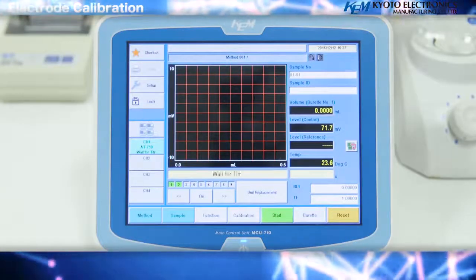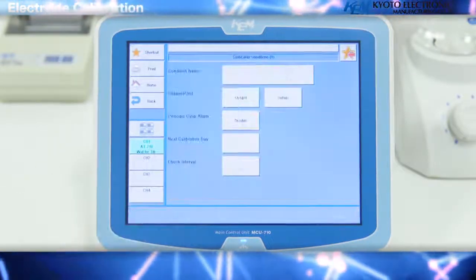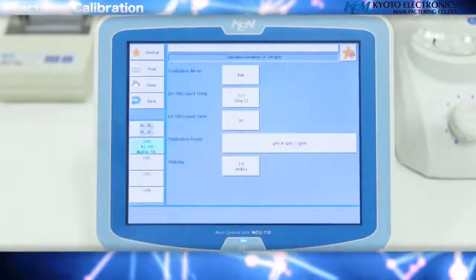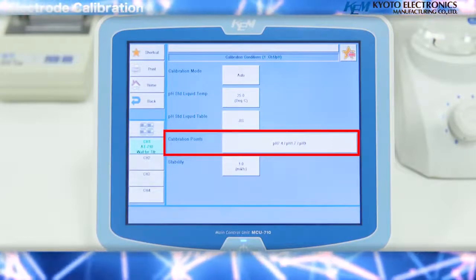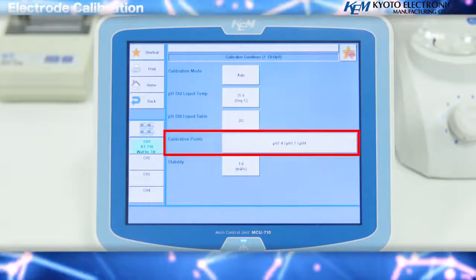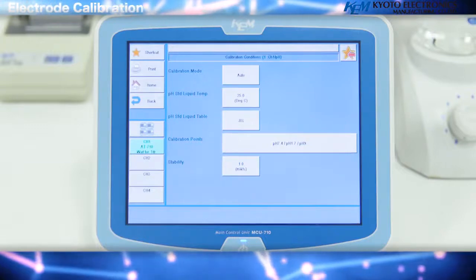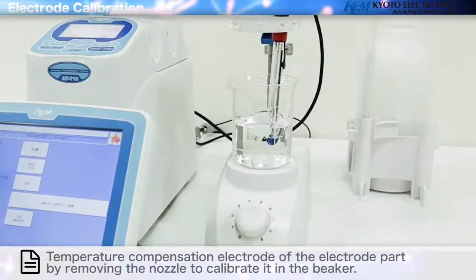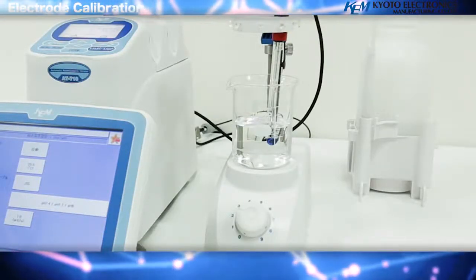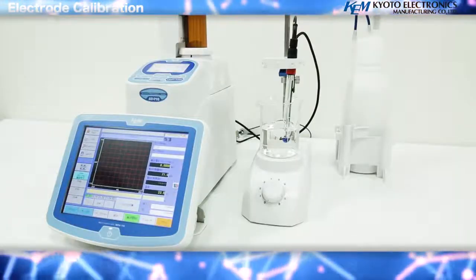Electrode calibration: calibration condition setting channel. First, press the calibration key, then press edit. Press the details key of the calibration condition settings channel and check the calibration point. The values should be set to pH 4, pH 7, pH 9 — you may set these values at will. Please leave the electrode and the temperature compensation electrode in the electrode holder and remove the nozzle to calibrate the electrode. When done, press the home key to return to the home screen.